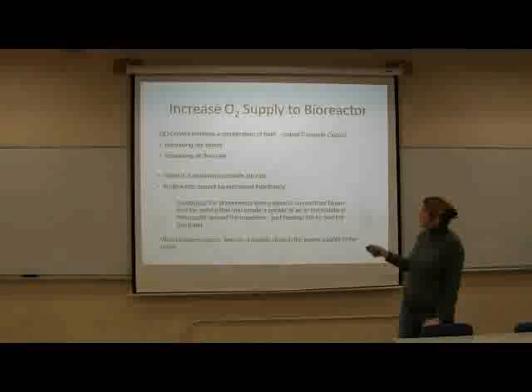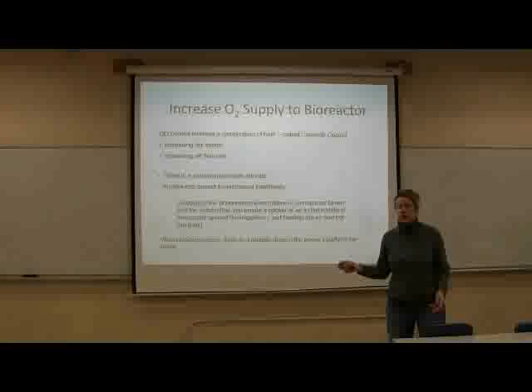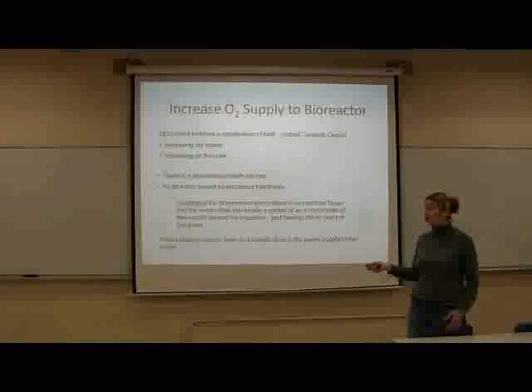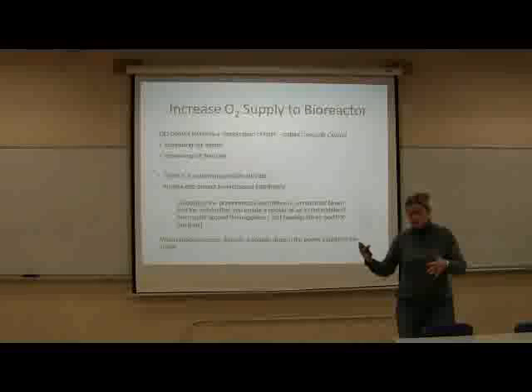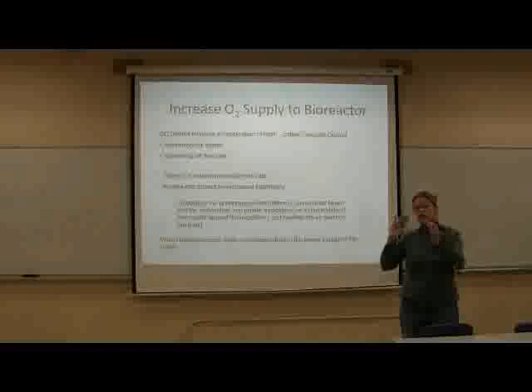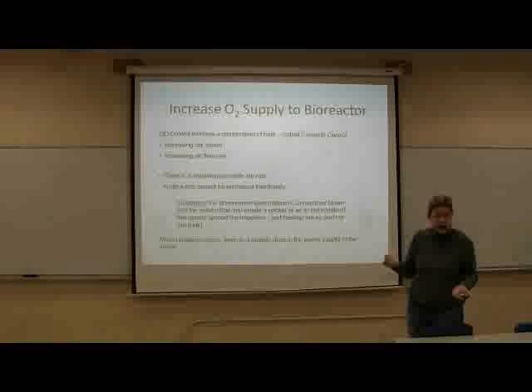But there's going to be a maximum possible stir rate on the bioreactor. The motor will only spin so fast. I think it's like 1,000 RPM. And the airflow rate cannot be increased indefinitely, because you flood the impellers. I explained this in the 160B class, but basically you're flowing so much air in there that a pocket of air forms around the impellers, and they're not stirring liquid, they're stirring air.